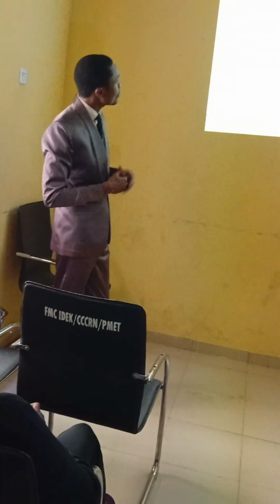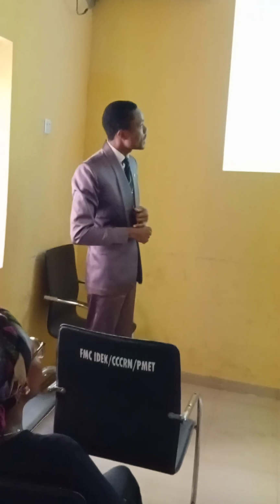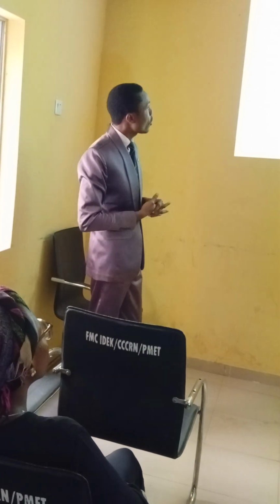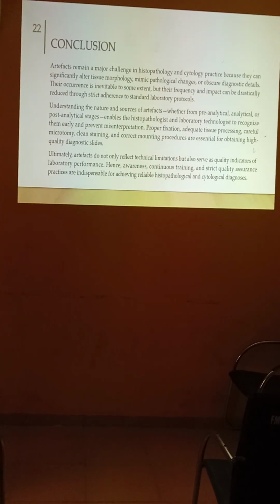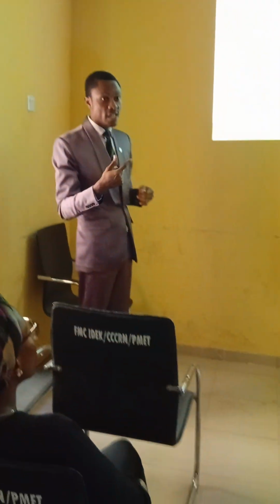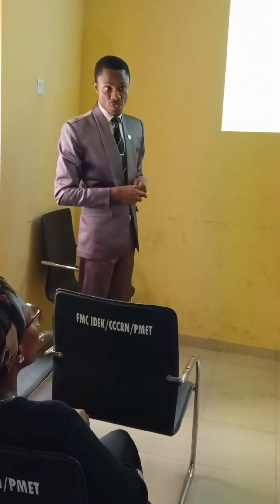The next slide. In conclusion, artifacts remain a major challenge in histopathology and cytology practice because they can significantly alter tissue morphology, they can also mimic pathological changes, or they can obscure diagnostic details. Their occurrence is inevitable to some extent, but their frequency and impact can be drastically reduced through strict adherence to standard operating procedures. Understanding the nature and sources of artifacts, whether from the pre-analytical stage, the analytical stage, or post-analytical stage, enables pathologists and laboratory technologists to recognize them early and to prevent misinterpretation.